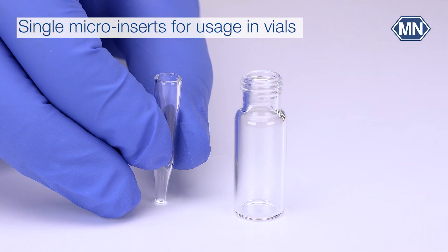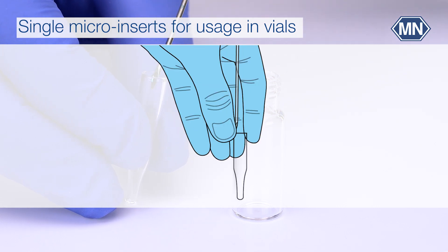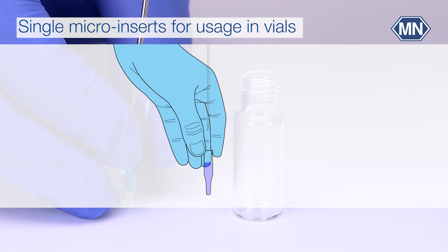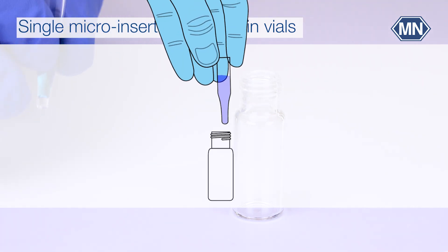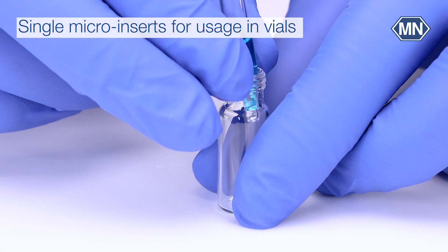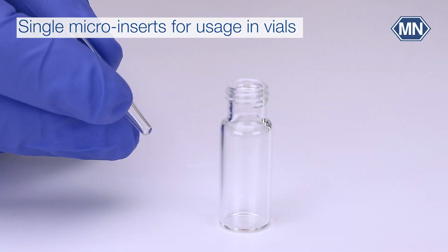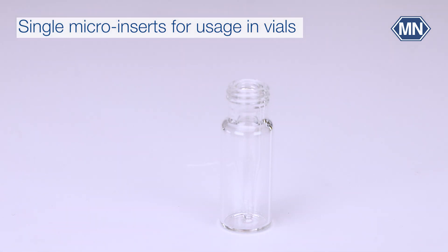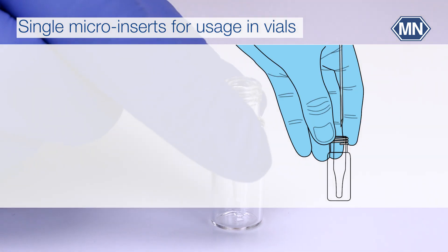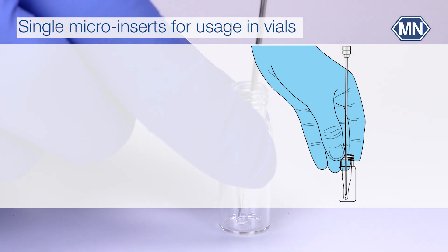If you hold the insert in your gloves during filling, it is not easy to do so due to the small size — even more so as you still have to put it into the vial afterwards. On the other hand, if you first insert the micro insert into the vial, fitting has to be carried out very carefully and precisely, and the insert is not firmly fixed.